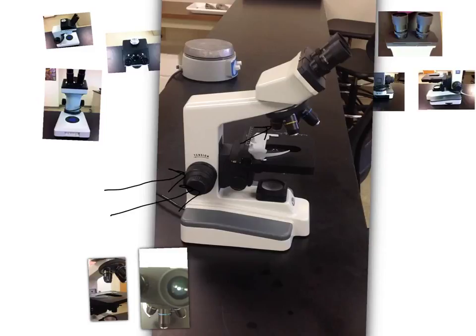So here's our lowest, this is 4, and we have our 10, and then we have our 40. We also have a white one, which is 100. We're not going to be using that today, or in lecture this week, or lab this week. That's because that's for oil immersion, and we're not going to be using oil.